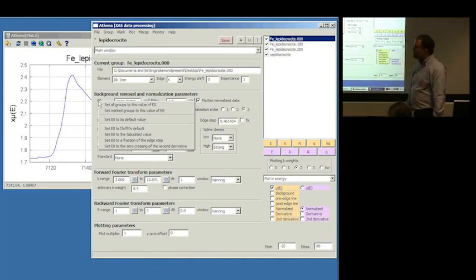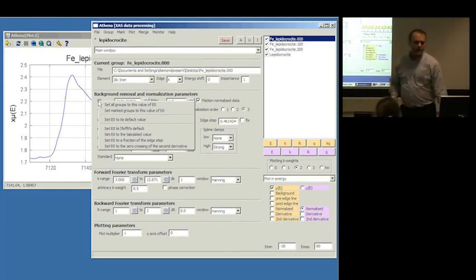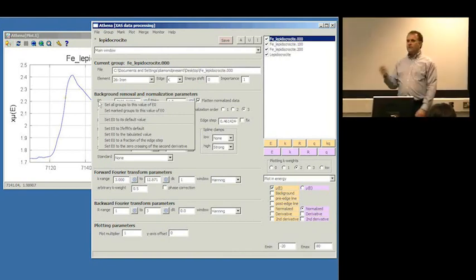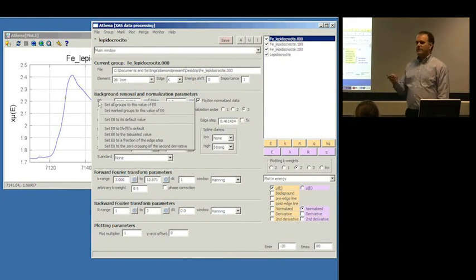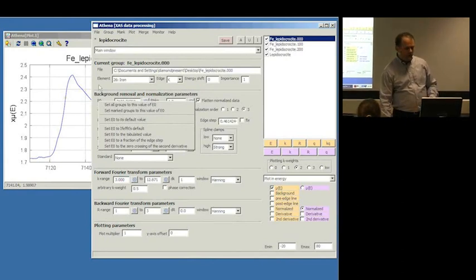And there was one other thing I wanted to say about E0. None of this says what the right value is. All I've really said is how to choose a value consistently over an ensemble of data. And the right value is a little confusing because E0 serves two purposes.